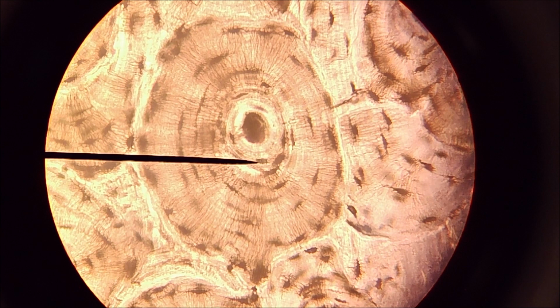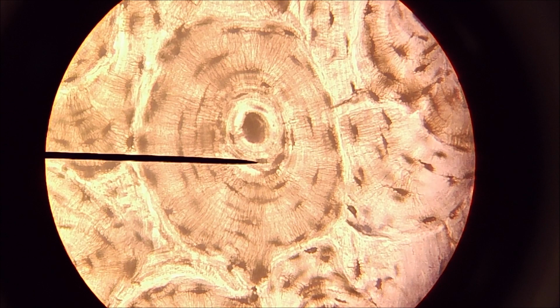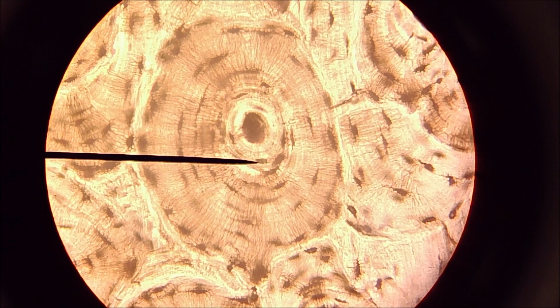Now, the central canals will have arteries and veins and nervous tissue going through. And actually, if you look, it's kind of hard to make out in some cases, but it looks good here. Can you see all the little webby, cracky type stuff kind of in between? All these little lines in between, those are actually small openings that allow for the diffusion of nutrients and waste products. And there's little bits of nervous tissue that travel through there as well, so that all the bone cells can then communicate with the central canal, which then communicates with the brain. And that is bone tissue.